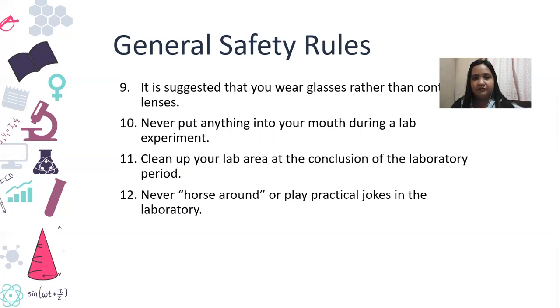Number 10, never put anything into your mouth during a lab experiment. Of course, we want to prevent you ingesting something toxic. So please, as much as we can, do not put anything in your mouth during a lab experiment, even if it's just a candy. If you want to eat candy, please wash your hands first before you take that candy with you.